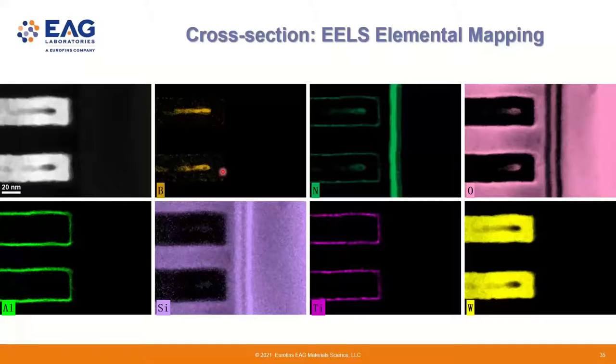Or do the quantification instead of with just the standard cross sections, you could use standards. Yeah, I think, Liam, you mentioned a very good point about using standards, right? If you go to the Digital Micrograph version 3, you do have the option of using standard quantification, right? The beautiful thing about the EELS community is it's pretty open. I think Gatan made the platform pretty open. You can write a script, everybody can share a lot of stuff in the public domain.